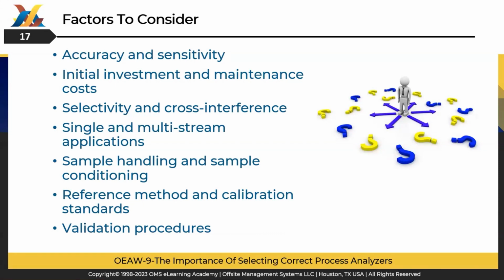Reference method and calibration standards, how the analyzer will be calibrated. It's something that requires special attention and effort. And validation procedures, how we may validate the performance of process analyzers, and any special tools or chemicals that will be required for that.